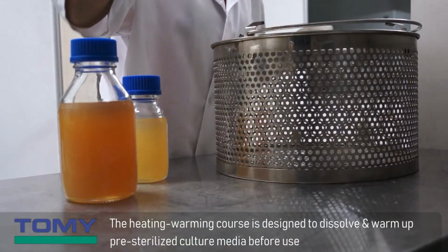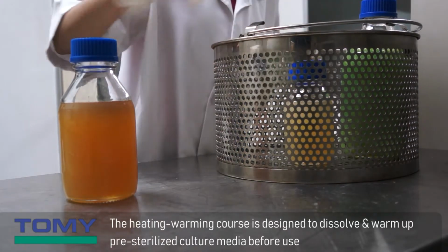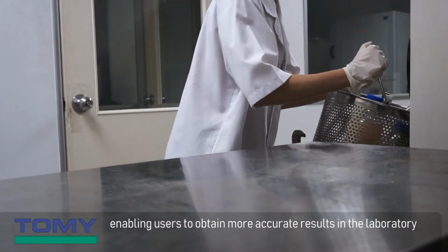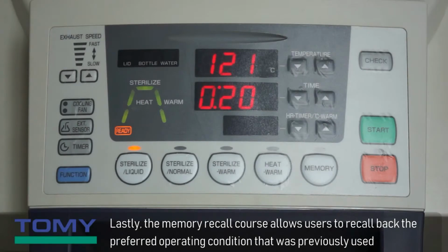The heating warming course is designed to dissolve and warm up pre-sterilized culture media before use. This course omits a sterilization cycle to prevent denaturation of the media, enabling users to obtain more accurate results in the laboratory. Lastly, the memory recall course allows users to recall back the preferred operating condition that was previously used.